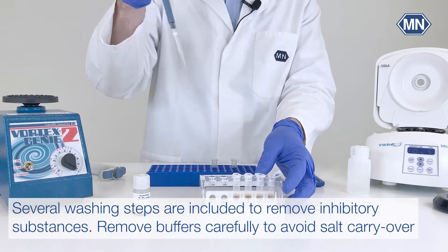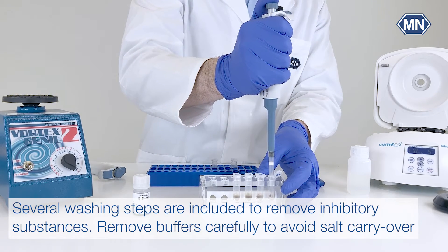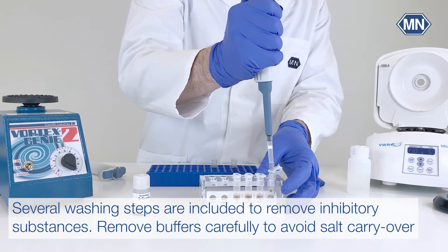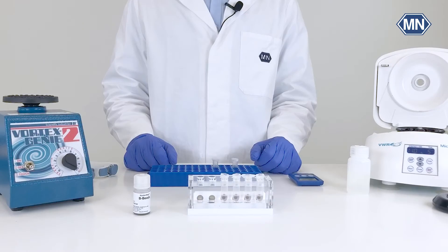Several washing steps of the magnetic beads are included to efficiently remove potential inhibitory substances. Please make sure to remove the buffers thoroughly in order to avoid salt carryover.